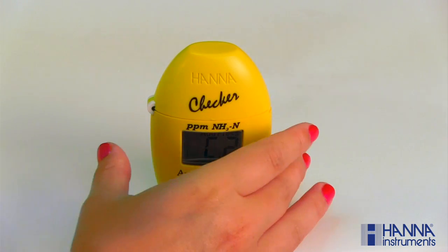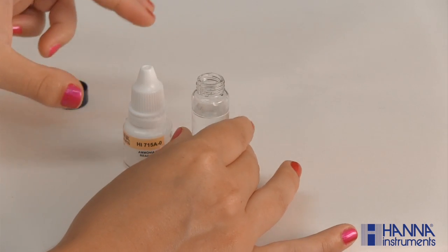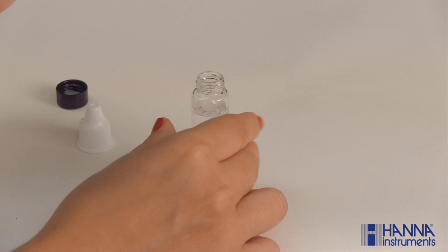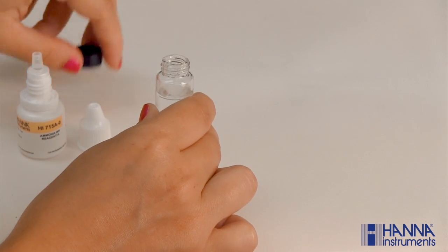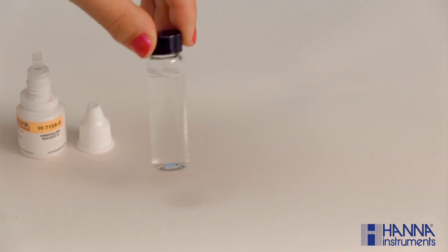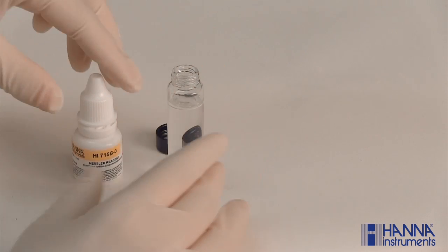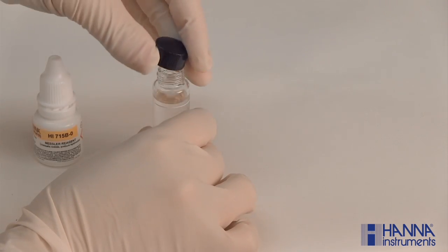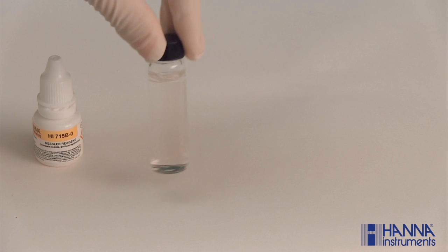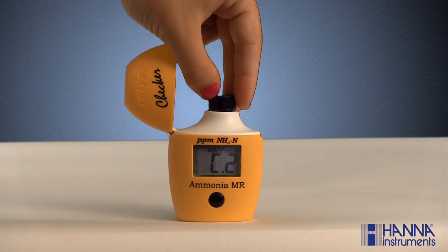Remove the cuvette and add four drops of our HI-715A-0 reagent. Replace the cap and swirl. Remove the cap again and add four drops of our HI-715B-0 reagent. Replace the cap and swirl. Lightly tap the cuvette to remove any bubbles that may interfere with the reading. Wipe and index the cuvette back into the checker and close the cover.